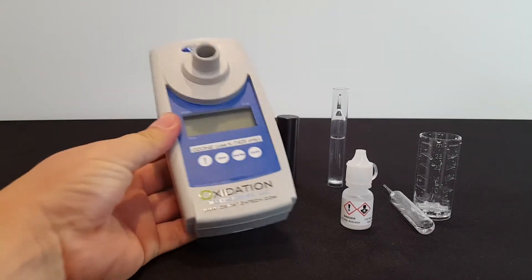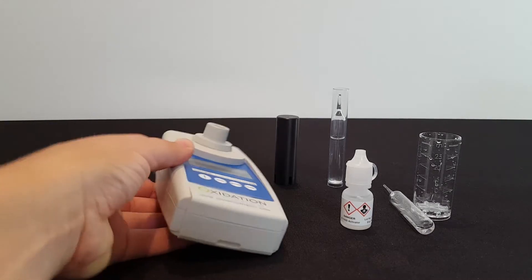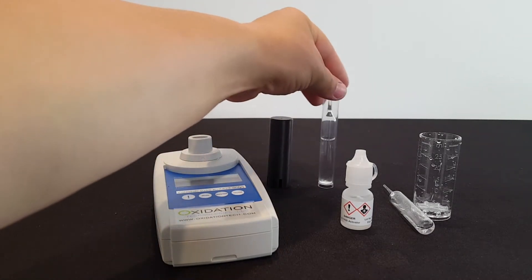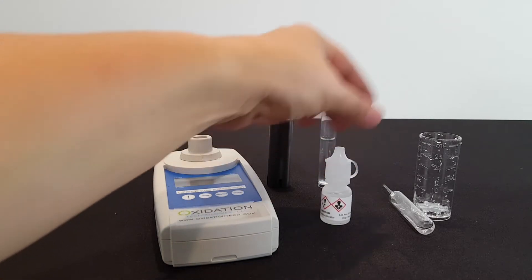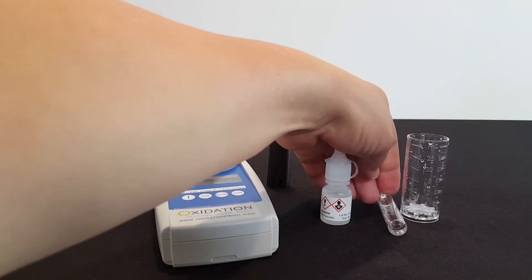For the test, we need the I-2019 dissolved ozone meter, the light shield, the zeroing ampoule, the activator solution, the 25 milliliter test cup, and the test ampoule.